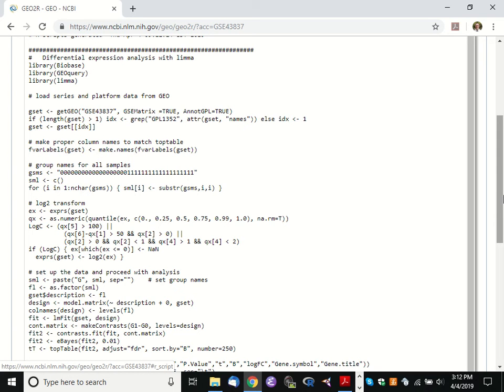So that's useful. Ordinarily, I would have you dig through the remaining questions on the document, but I think we're probably already up against our time boundary. So I hope that this has been useful. You can look in a repository, find a data set, reanalyze it if the repository offers functionality like that, and even evaluate, do you support the claims made by the authors in their publications? You, as a growing scientist, are empowered to do that. You are expected occasionally to do that.